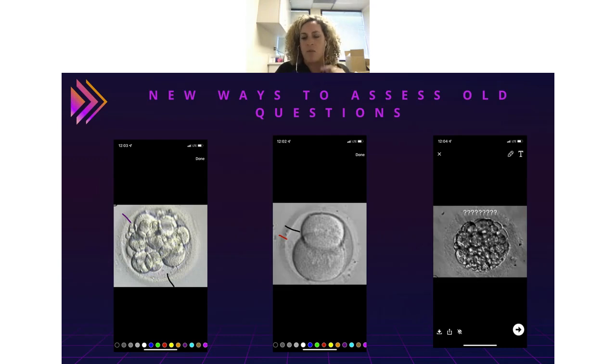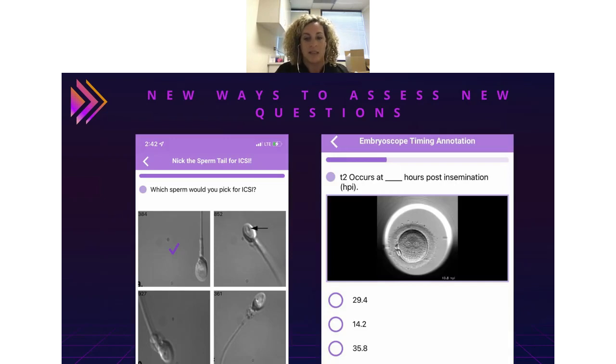There's a question here about whether the profile documents that you upload carry over when you start at a new clinic. Yes. Inside of our platform, there is a tab that says IVF practice list. We have made the IVF practice list work so that you put in a resignation date at one practice, and then you can add another practice. And your data goes with you. The data is de-identified. You'll be able to keep your documents, and you will also be able to keep your de-identified patient statistics. I know a lot of people are using the platform to personally keep their own statistics, particularly while they're training, so that they have that evidence of their competency when they move from practice to practice.